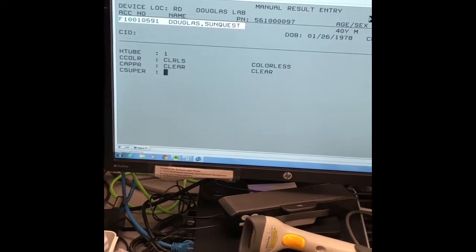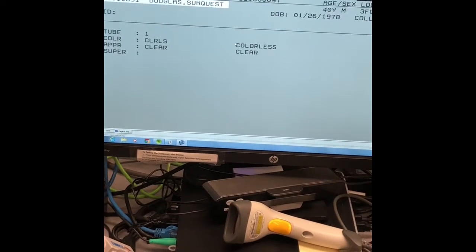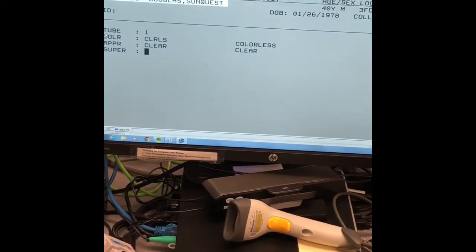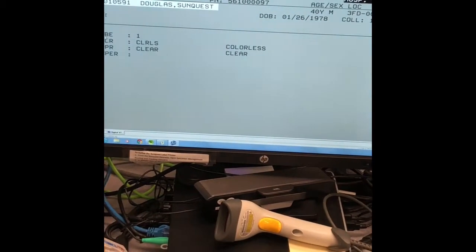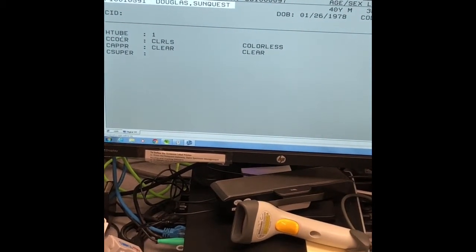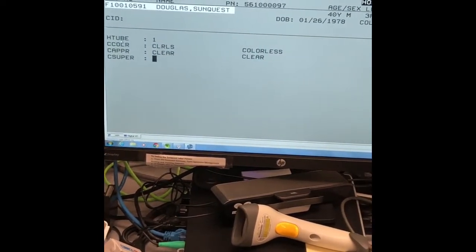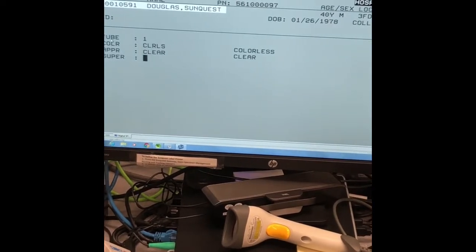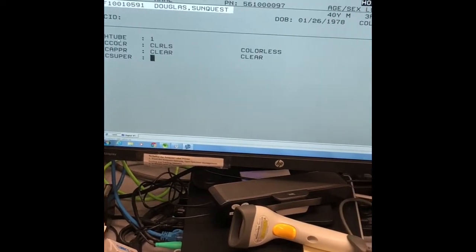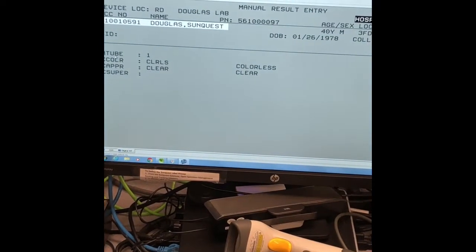Can you go through what is in the procedure with the tube numbers? Remember, it could be number one or four. That's another important thing. If it's an adult, most of the time you're gonna get 1, 2, 3, and 4. So pretty much for doctor request, at least if they messed up the order, they probably know upstairs or at the ER. But most of the time you count 1 and you count 4.